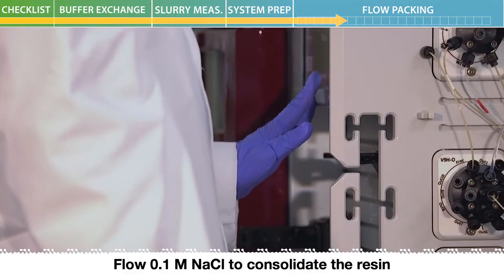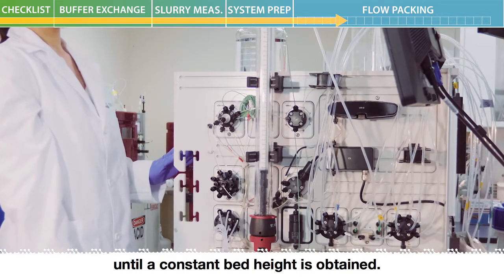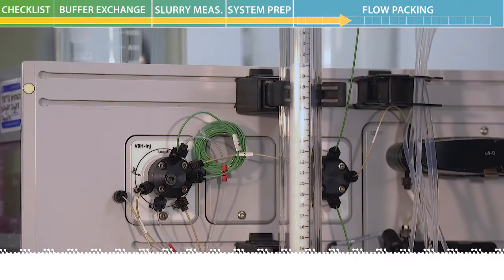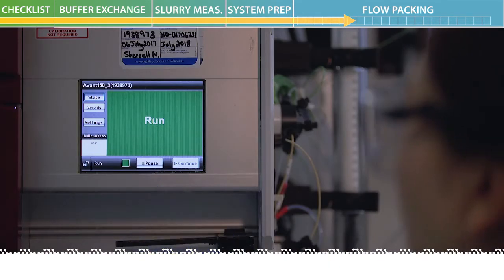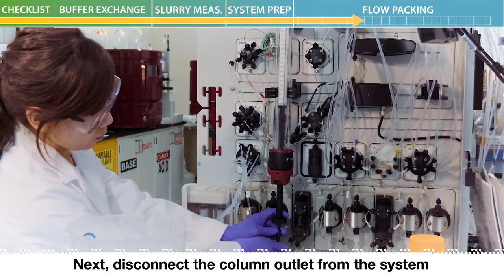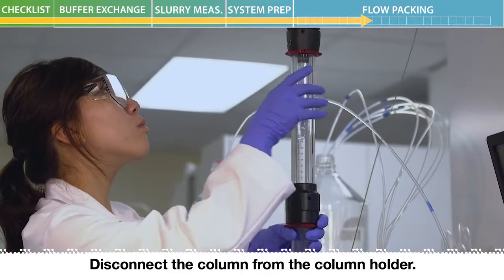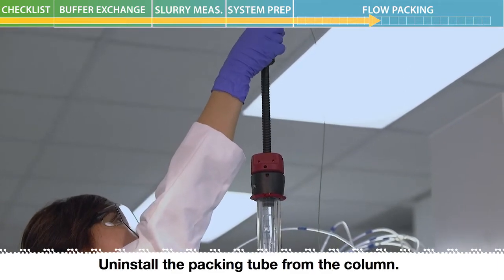Flow 0.1 molar sodium chloride to consolidate the resin until a constant bed height is obtained. In this video, the resin was consolidated at 800 centimeters per hour. After a constant bed height is obtained, stop the flow. Next, disconnect the column outlet from the system and install a stop plug. Disconnect the column from the column holder. Uninstall the packing tube from the column.